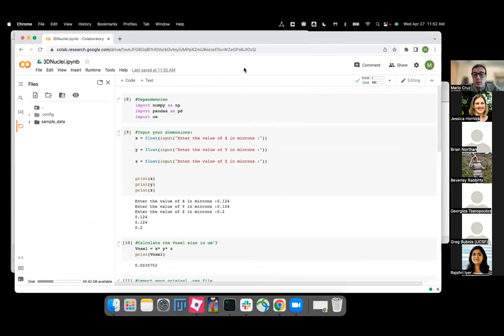Okay, so you're asking if you can create this dependence inside Cell Profiler just to have this output in the end? Yeah, essentially, because you load the pixel dimensions into the Cell Profiler pipeline, so in my understanding, all the data is basically on hand. We were discussing this last week with Beth and all the group, and it's not an impossible thing to do.